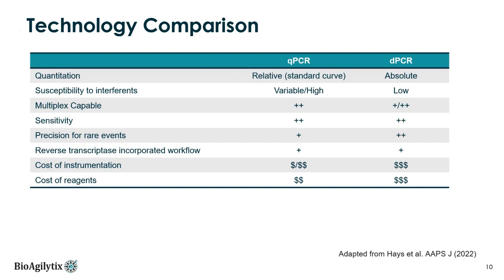Both platforms allow for use of the reverse transcription workflow, and the cost of instrumentation and cost of reagents differs slightly between the two, given that digital PCR is a little bit newer with respect to technology.